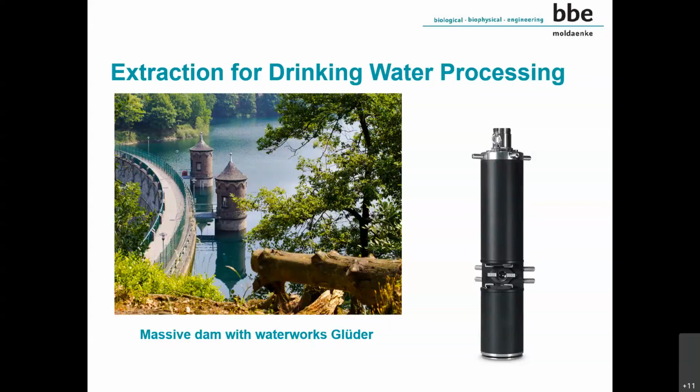And they use, for example, different instruments for the measurement of algae contents. They extract the water from different heights of this reservoir, where they have tubes with openings so that they can extract the water, but they also perform measurement of this water intake because they want to avoid the uptake of cyanobacteria and other algae inside of this water. So therefore they use different instruments. Here on the right side, of course, is the FluoroProbe.